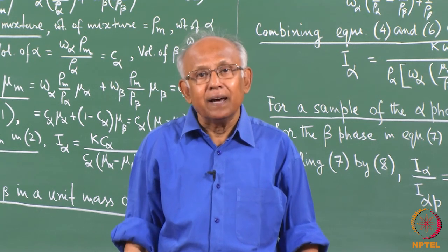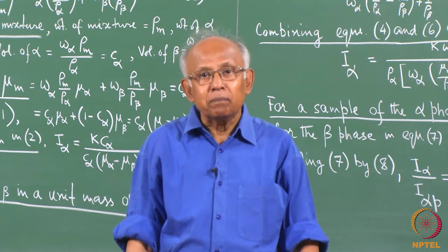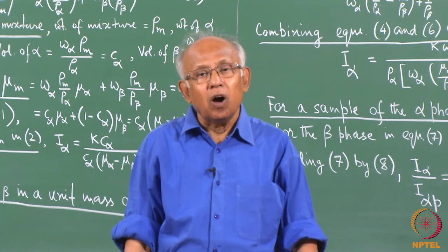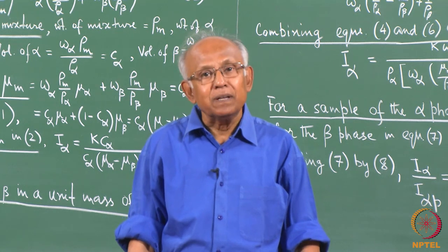In a similar manner, by distinguishing between the powder patterns or powder X-ray diffraction patterns of two substances or phases, the two phases can be distinguished.